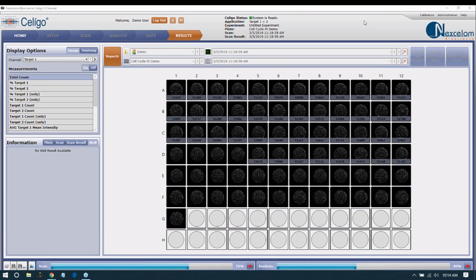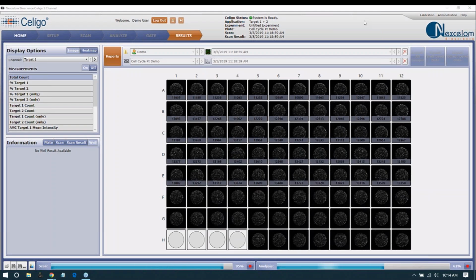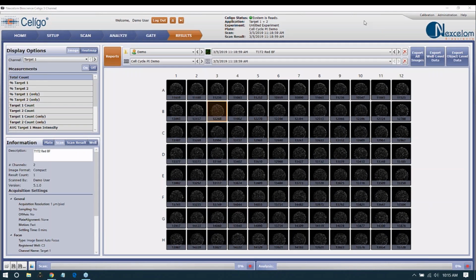You can see the counts now are coming from the nuclei of the red channel, and it's about 13,000. So even though I might have plated 10,000, the cells overnight probably proliferated just a little bit, so now we're above that. And now it'll give you a little bit of understanding of cell density for this type of assay.